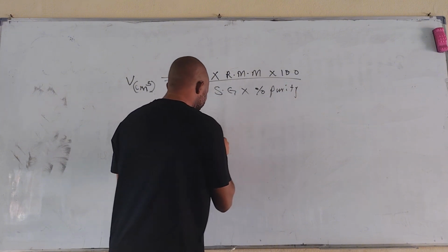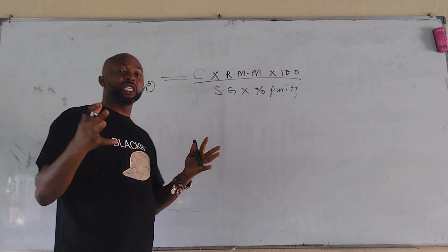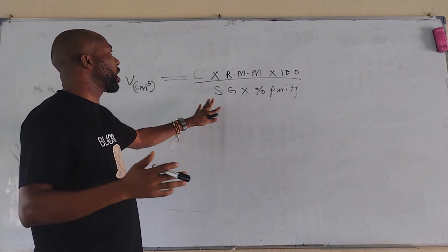So when we are calculating the volume concentration of acid, which are often in the liquid form, this is the formula we're going to apply to do that.